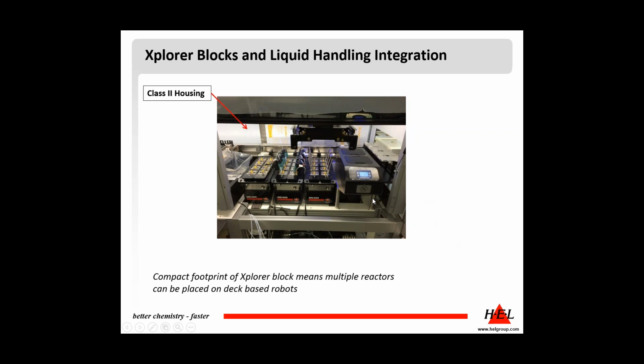So for an example here, we've got this housing covering the whole system. This example shows micro plates that have been used for seed plate purposes, so samples are taken to inoculate the bioreactors. Here we have the bioreactor positions, they're fully instrumented, and you can see in the middle there's channels for the liquid handling to take place.